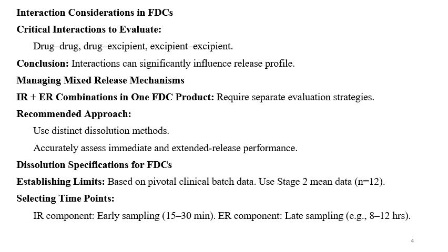Also, if the fixed dose combination is available in different release mechanisms, managing the mixed release mechanism becomes very important and critical. If the formulation contains an immediate release dose and an extended release dose in combination in one FDC product, like a bilayer tablet with one layer as sustained release, extended release or modified release and another layer as immediate release, then it will require separate dissolution conditions.